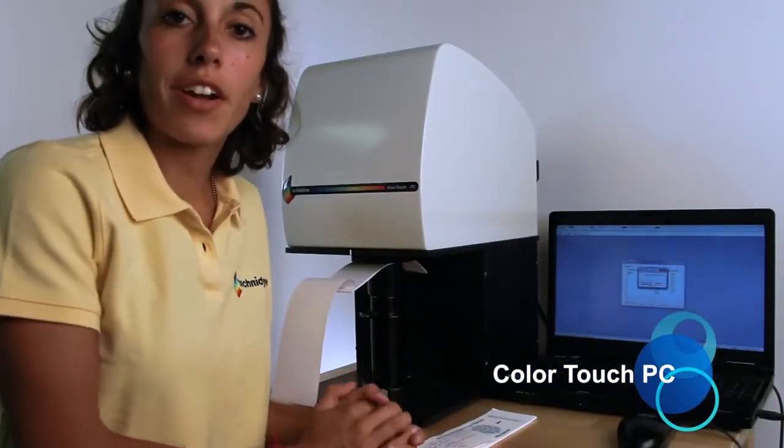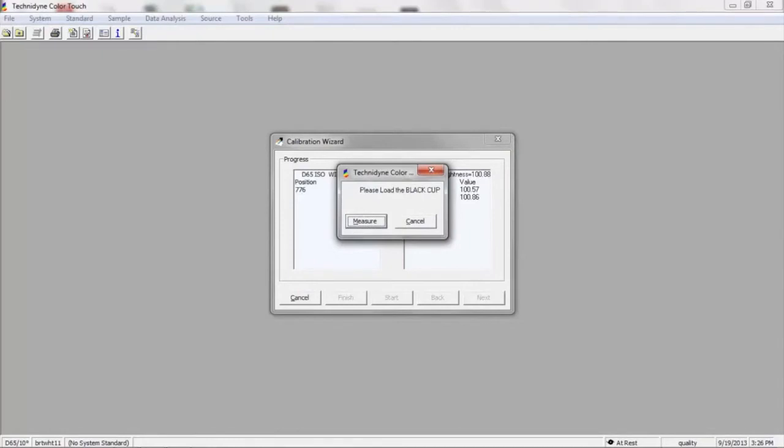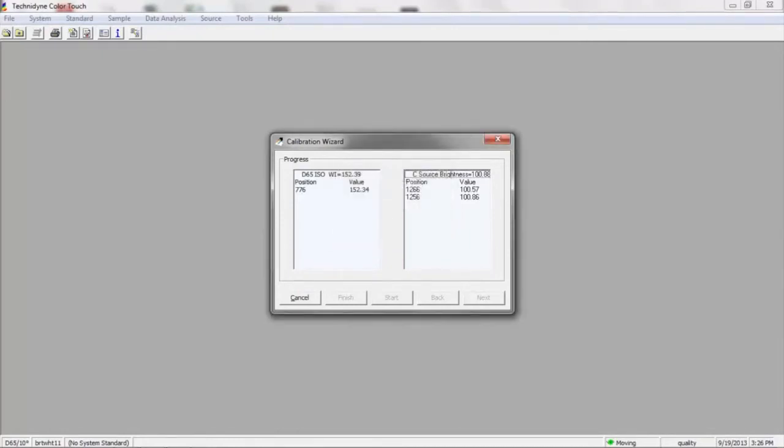When that's finished, our next step is to load our black cup and press measure. This is to verify the zero levels at each of the calibration positions.